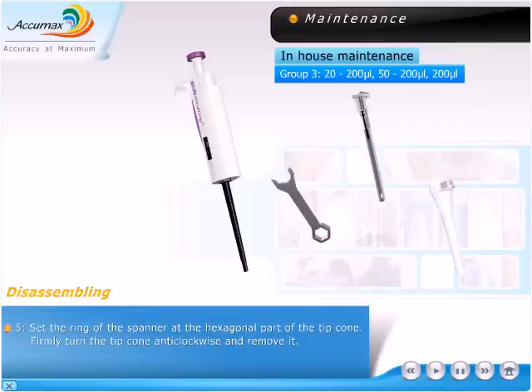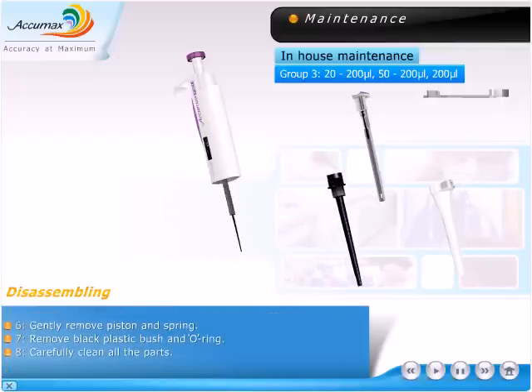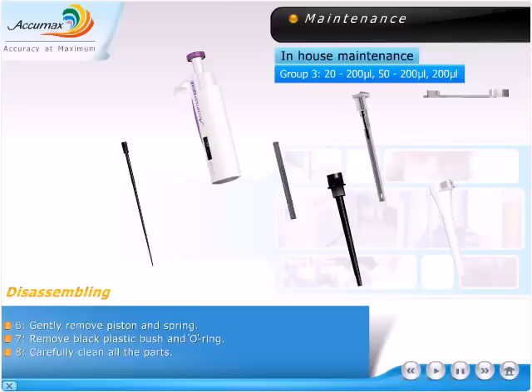Set the ring of the spanner at the hexagonal part of the tip cone. Firmly turn the tip cone anti-clockwise and remove it. Gently remove the piston and spring. Remove the black plastic bush and o-ring.